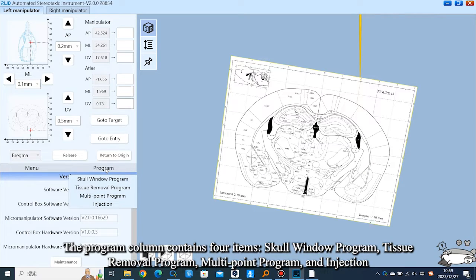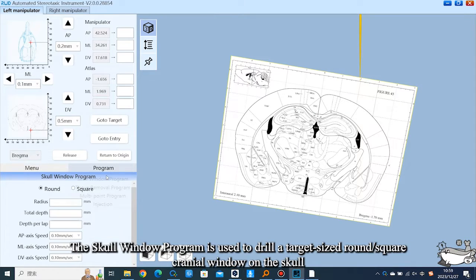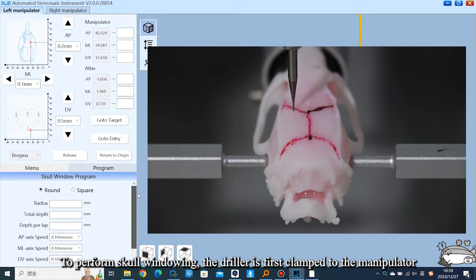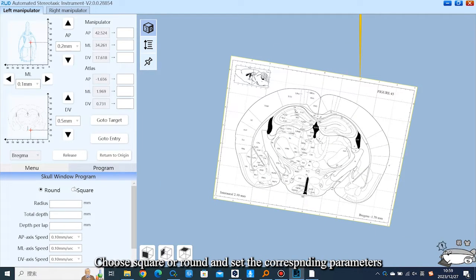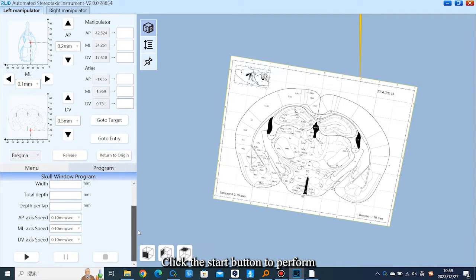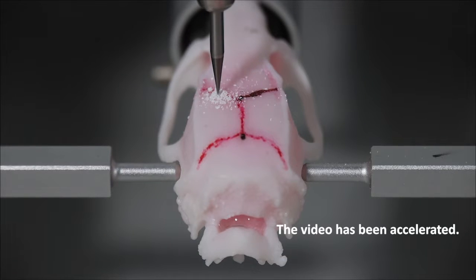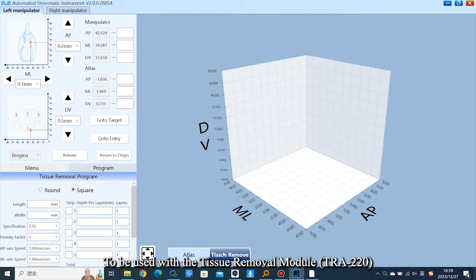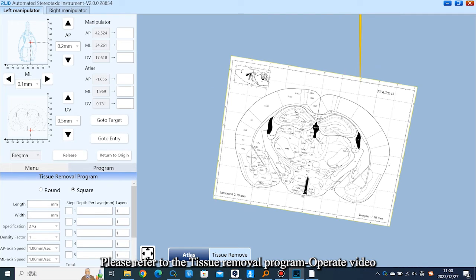The Program column contains four items: skull window program, tissue removal program, multi-point program, and injection. The skull window program is used to drill a target-sized round or square cranial window on the skull by controlling the precise movement of the driller fixed to the manipulator. To perform skull windowing, first clamp the driller to the manipulator. Choose square or round and set the corresponding parameters. The AP, ML, and DV axis speed is the speed of the manipulator with the driller; drilling speed is set by the driller itself. Click Start to perform. The tissue removal program reduces unnecessary damage from manual tissue removal and is used with the Tissue Removal Module TRA-220 — please refer to the tissue removal program operation video.